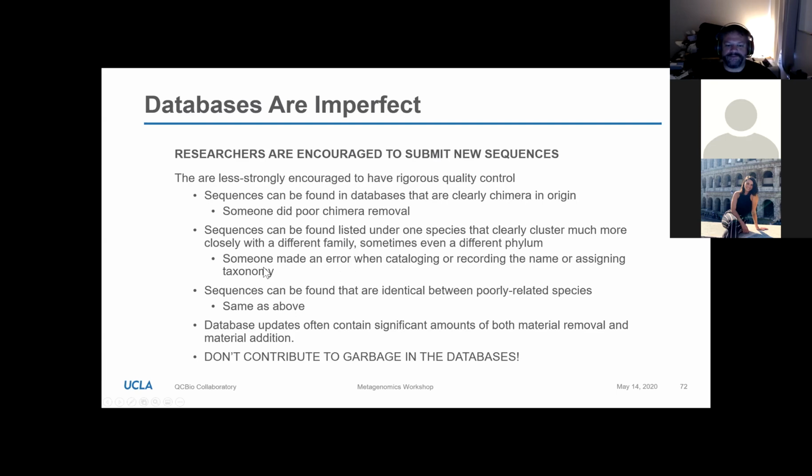Or I'm sorry, in this case, this one I haven't done myself, but I know people who do taxonomy trees on databases where they can show there's a branch that just kind of goes across different groups, where it was clear that somebody uploaded something as a B. subtilis strain that they discovered. But if you look at the taxonomy, it's clear that they had the thing named wrong, and it was probably some other species entirely, and they just gave it the wrong name, because mistakes happen.